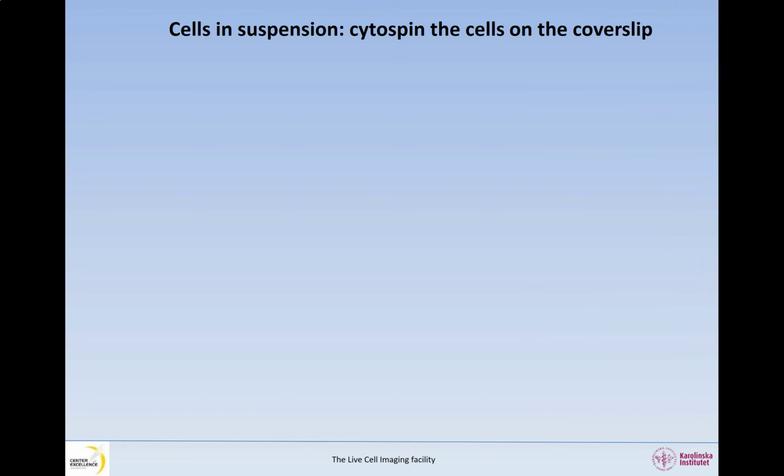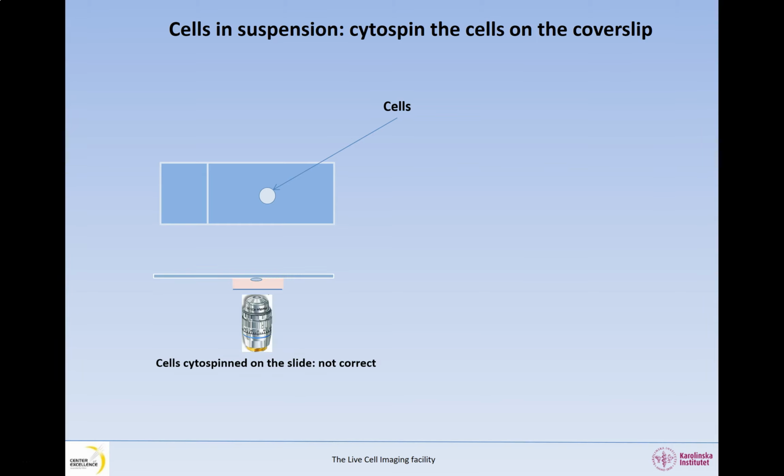Cytospin your cells on the cover slip. Cytospins were designed to spin cells in suspension on glass slides, and, as we explained earlier, this is not correct when it comes to imaging. Instead, you should cytospin your cells directly on the cover slip.